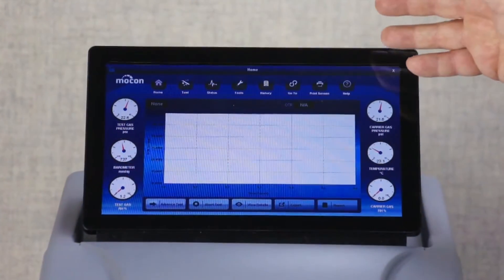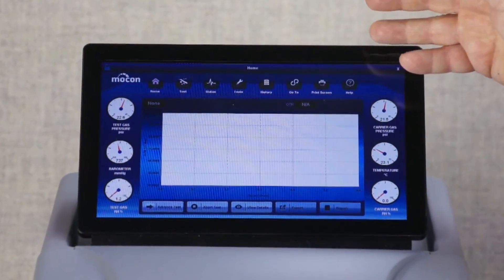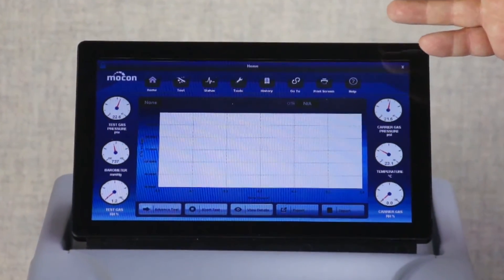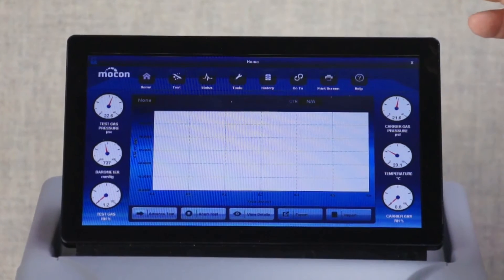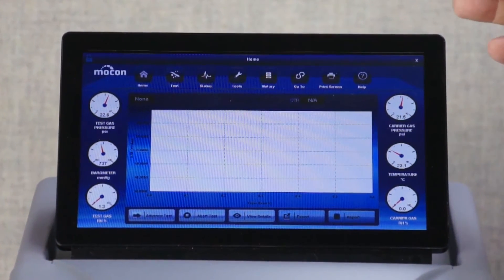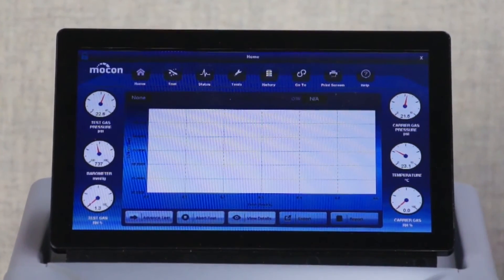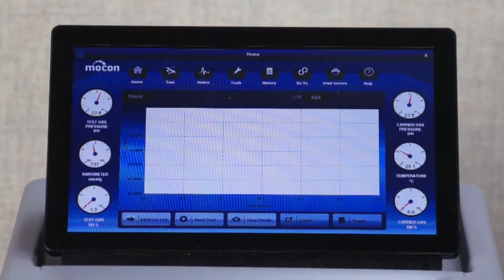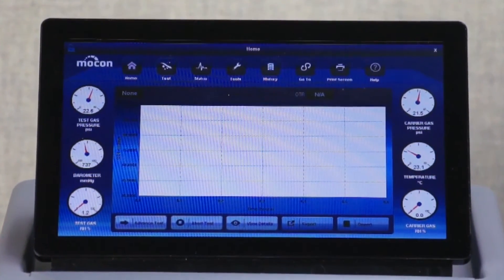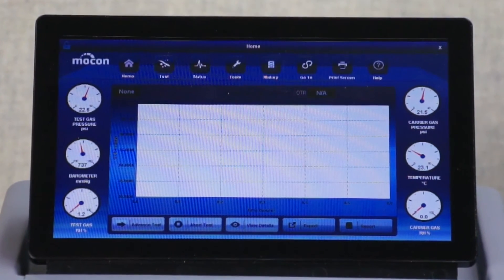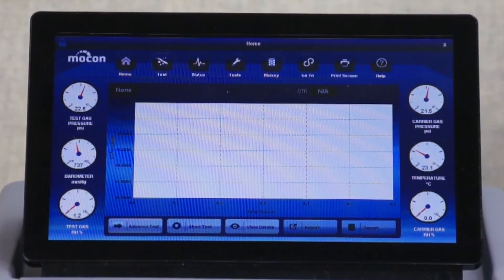In addition to the touchscreen, the optional PermNet Lite software allows an operator to view and operate the instrument on their own computer as if they were standing at the instrument.